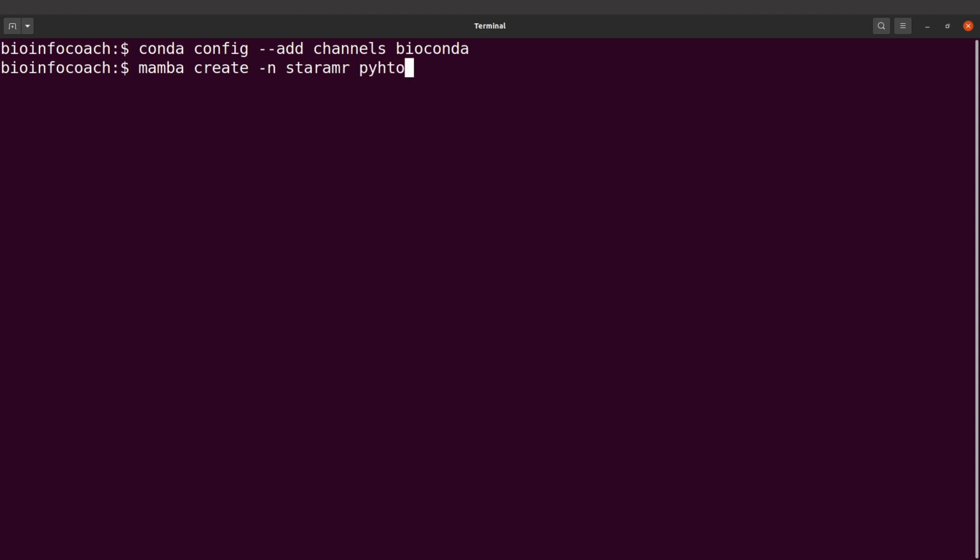So I'll say python=3.10.10. This is an example. So I'm using this version. Now, if you're using the latest version of Mamba, chances are the Python version you have is above 3.7. So you do fine without even installing Python, but I'm only indicating it here so that beginners don't get confused.